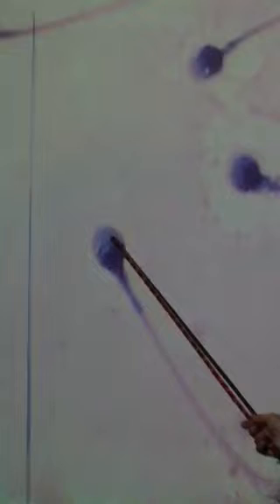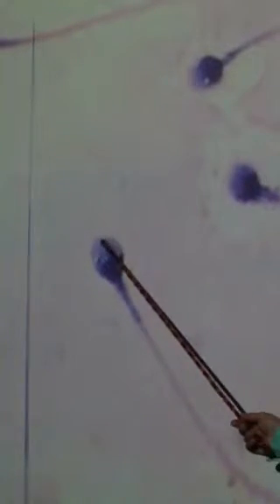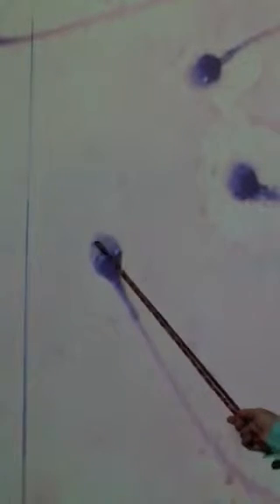This one shows you actually, what's the lighter area on the top called? Anybody remember what this is called? Okay, maybe we didn't get to it in lecture, but this is the acrosomal cap. This is the remnants of the Golgi apparatus, which contain hydrolytic enzymes. Because remember, the Golgi segregates lysosomes from secretory proteins. Anyway, here's your condensed nucleus covered with an acrosomal cap.